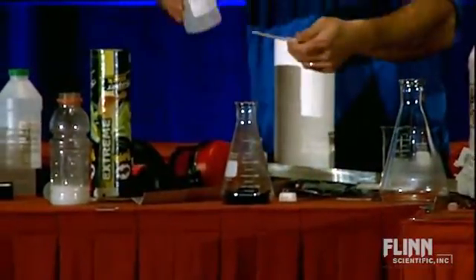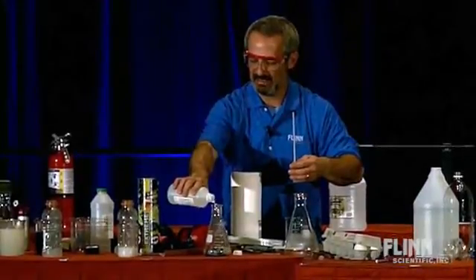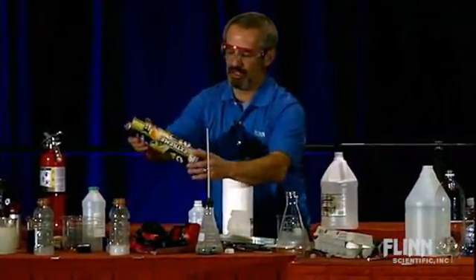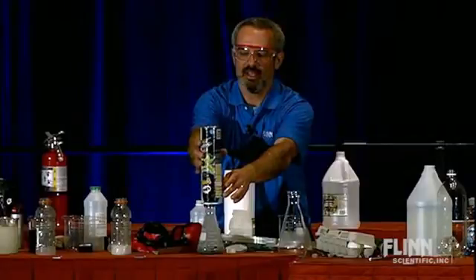Lots of different ways of generating hydrogen. I've got some zinc in the flask and some HCl here. This Pringles can has a hole there, a hole there, and a hole in the top which I've covered with tape.